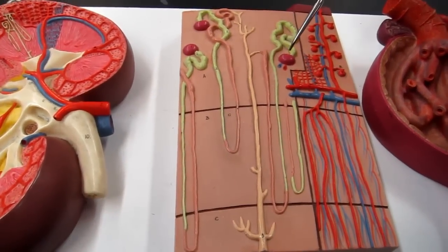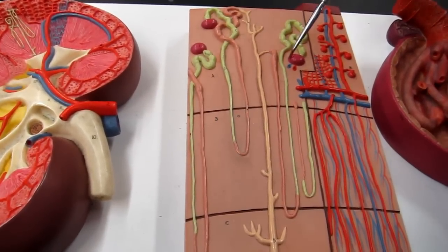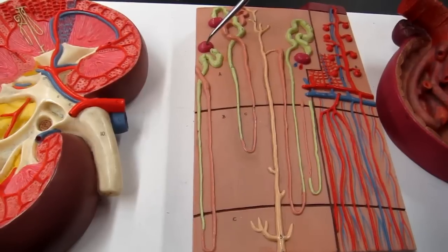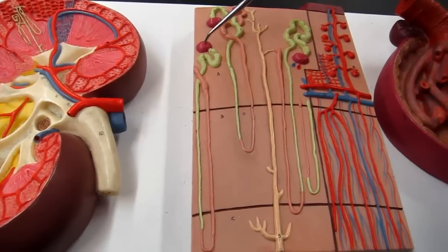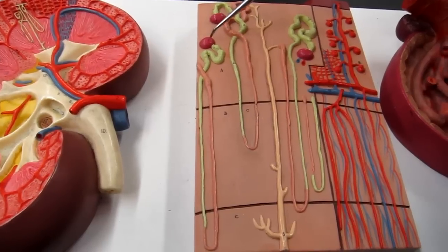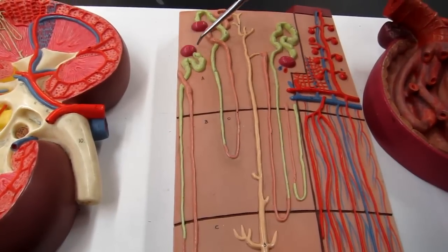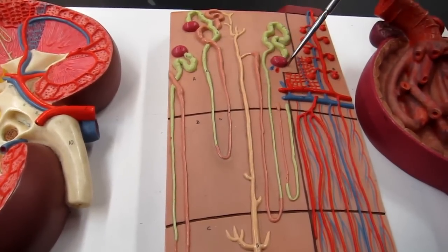Okay, now as we move over to these kind of purplish structures here that are attached to the renal tubule, they are representing the renal corpuscle. Okay, so the renal corpuscle, that wasn't on your sheet, but I know you've probably seen it as you've been reading and wondered what the heck that was all about. The renal corpuscle is where you have the glomerulus and the glomerular capsule together. Okay, so you can't really distinguish the two of them here. So this would be a renal corpuscle.